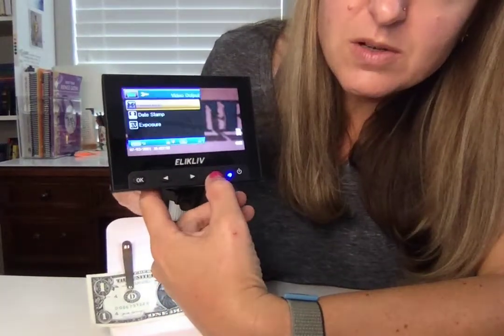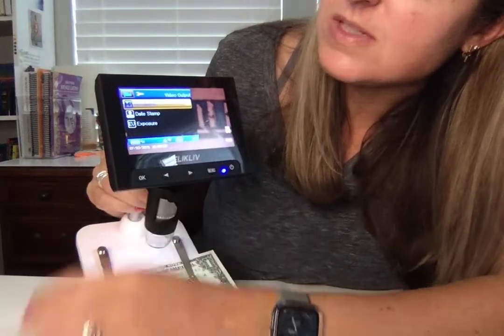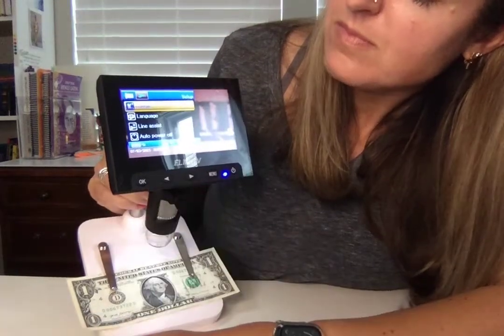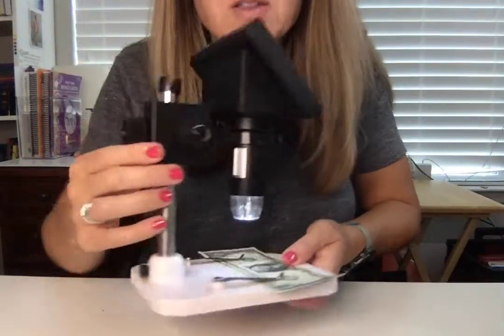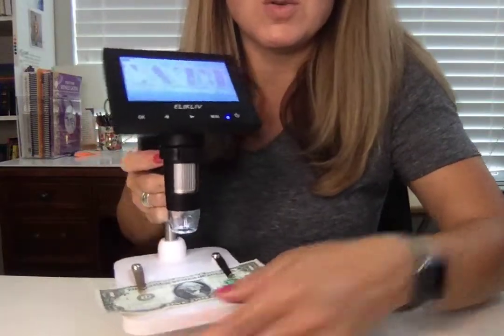There's a menu with different options — two different resolutions, a date stamp especially if you're saving images, and you can adjust the exposure. So there is lots to love about this digital microscope. It would make a great addition to your home, a great gift, and it's really fun to explore the world with.